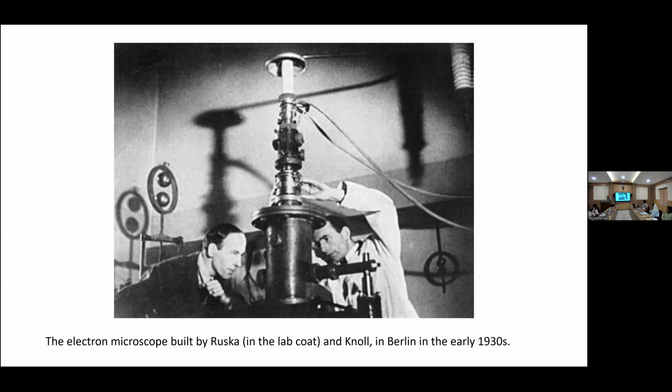So first we need a high vacuum system, or high vacuum condition, to generate the electron beam. The next thing is lenses. In an optical microscope, we are using a glass lens. It's just a convex lens. It's common, for telescopes, for microscopes, everywhere we are using convex lenses. The only change is the focal length of the lens.